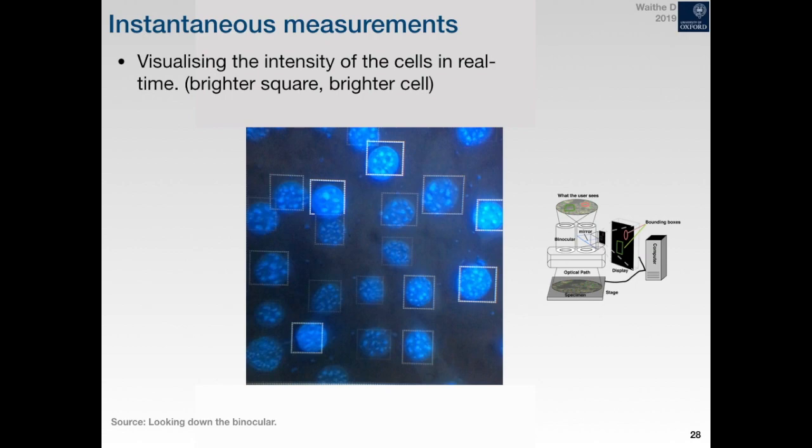I wouldn't go from 5 times to 100 times and expect particularly good results, but it would work to a certain extent. But you could definitely go from 20 to say 40 or 20 to 10, and it would work. So they're remarkably effective at handling those situations, much better than a specific algorithm written by an image analyst would be. That's the power of them.